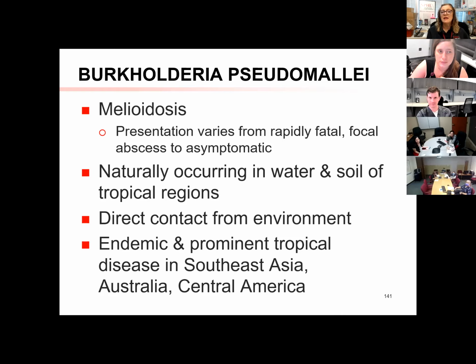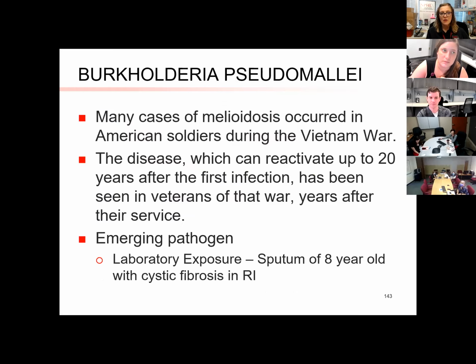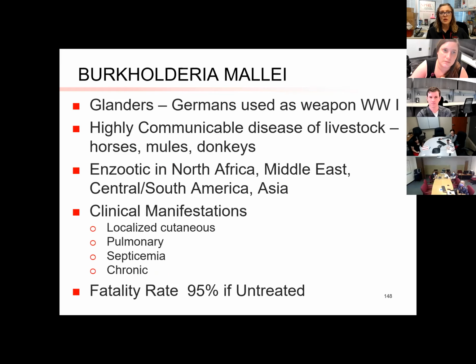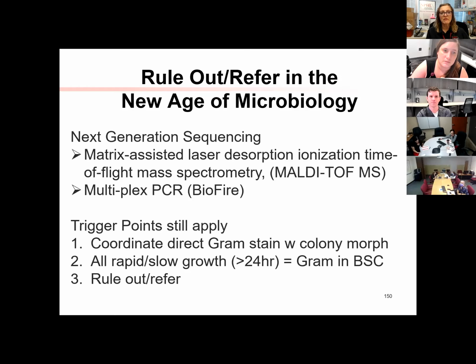So keep in mind the pseudomallei belongs to a different group where Yersinia and pseudomallei, these are gram-negative rods. So they're going to be honking big gram-negative rods, and look at the characteristics there that you can identify from even the morphology or possibly the clinical presentation. Read through those. I've got some gram stains. I've got some MacConkey plates to show you. So it'll walk you through the answers of all of those.